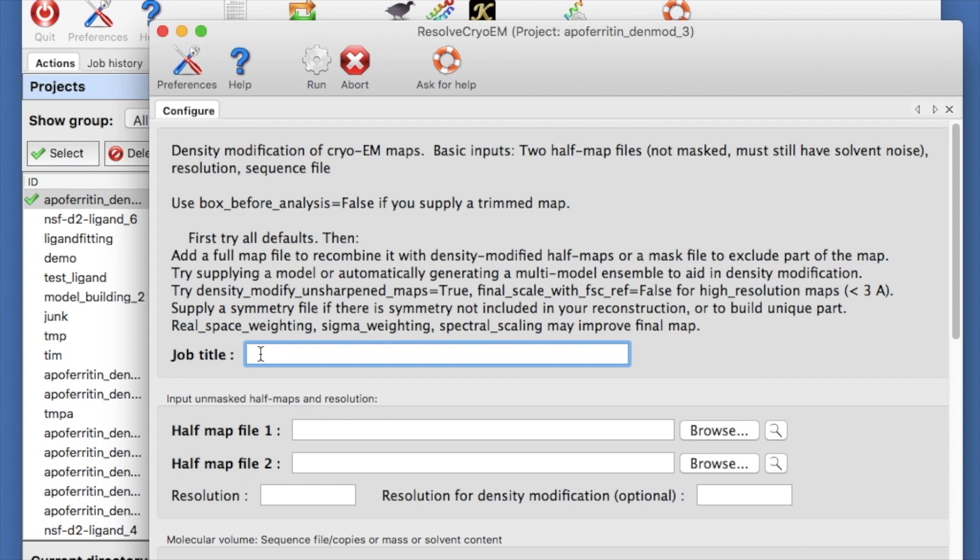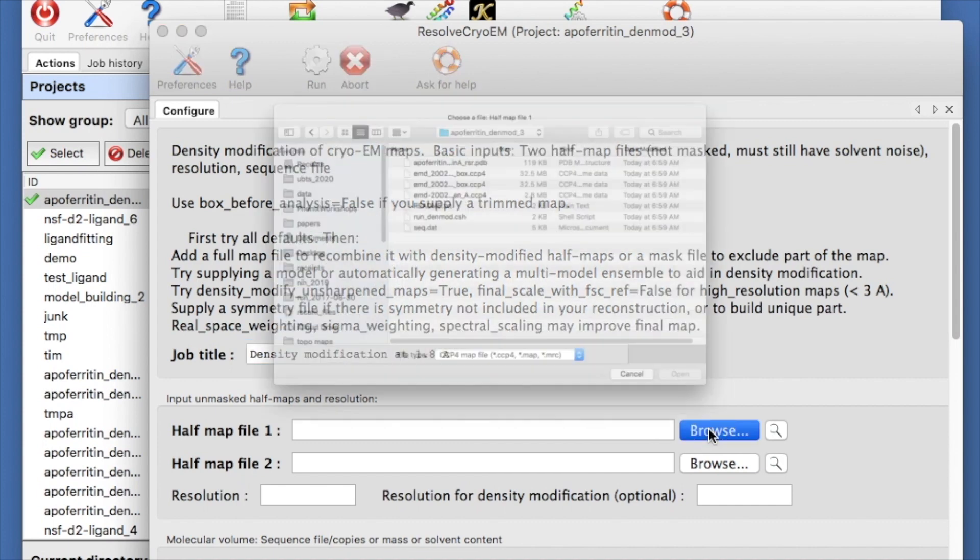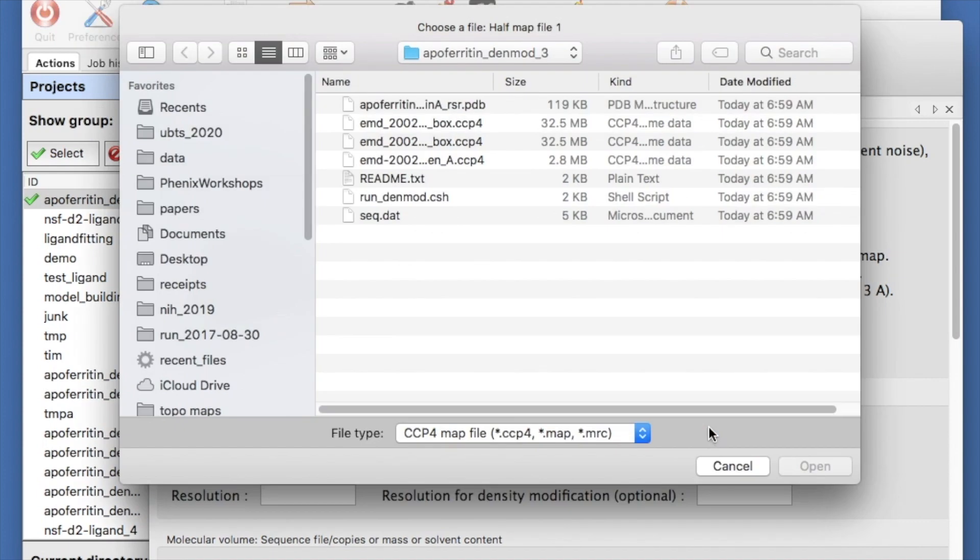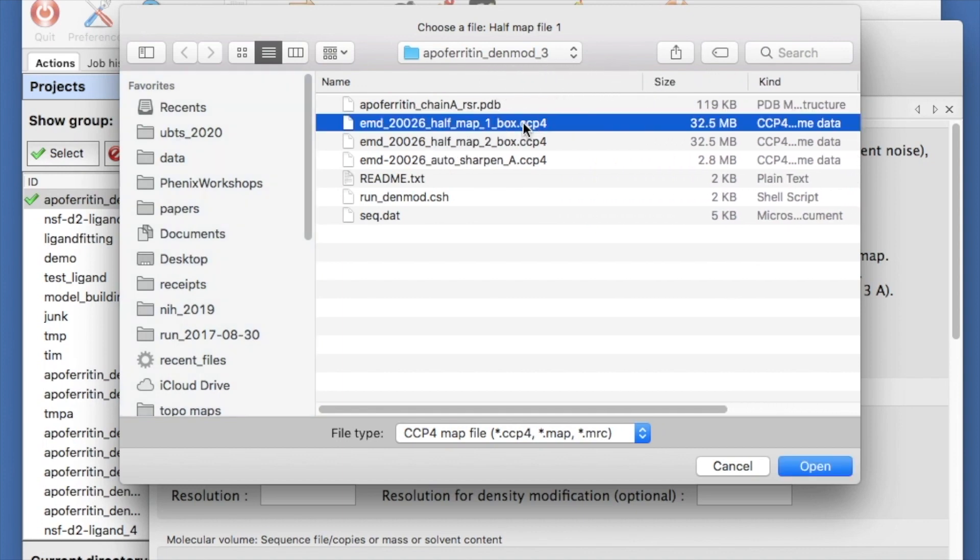We are going to run starting with two half maps. These should be unmasked and as unprocessed as possible. Let's put in a title. Let's put in the two half maps. They are in the directory that was created when we set up the tutorial. The half maps are already cut out from the original maps and are called halfmap1 and 2 box.ccp4.